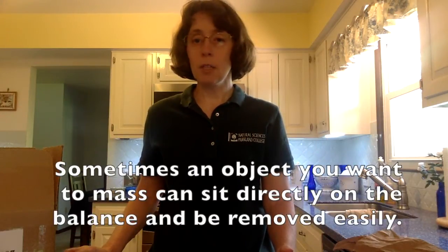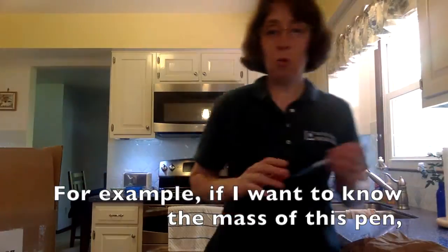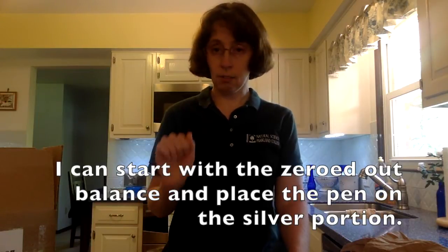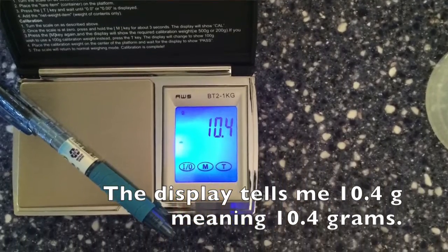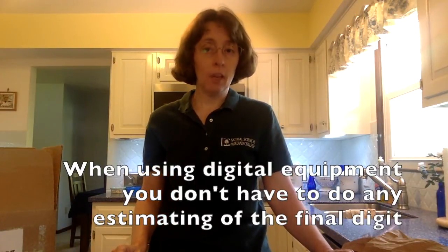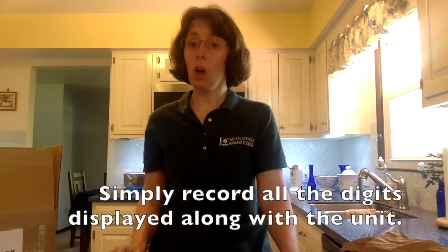Sometimes an object you want to mass can sit directly on the balance and be removed easily. For example, if I want to know the mass of this pen, I can start with the zeroed out balance and place the pen on the silver portion. The display tells me 10.4 g, meaning 10.4 grams. When using digital equipment, you don't have to do any estimating of the final digit because the machine does the estimating for you. Simply record all the digits displayed along with the unit.